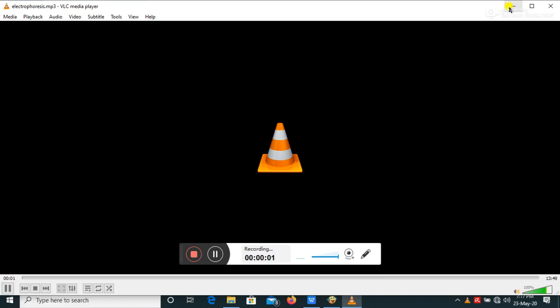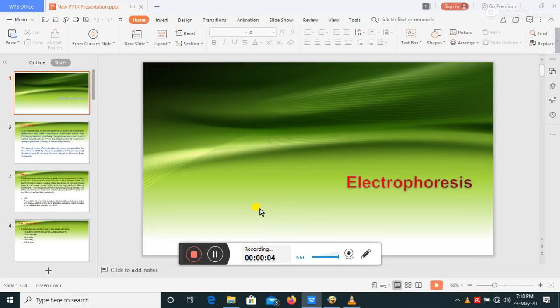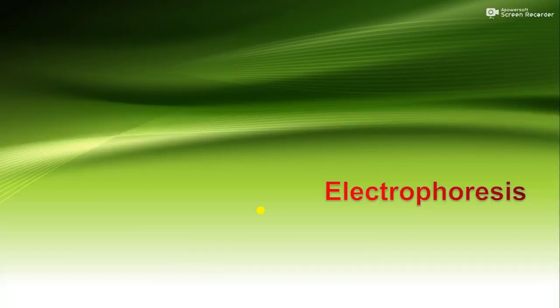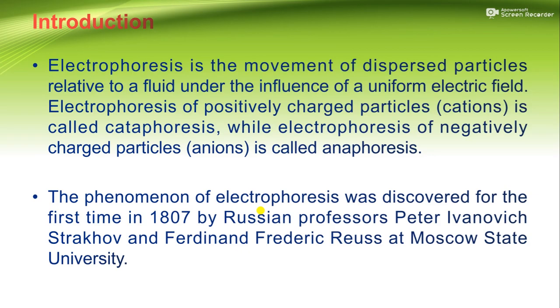Hello everyone. In this presentation we will learn about electrophoresis. Introduction. Electrophoresis is the movement of dispersed particles relative to a fluid under the influence of a uniform electric field.